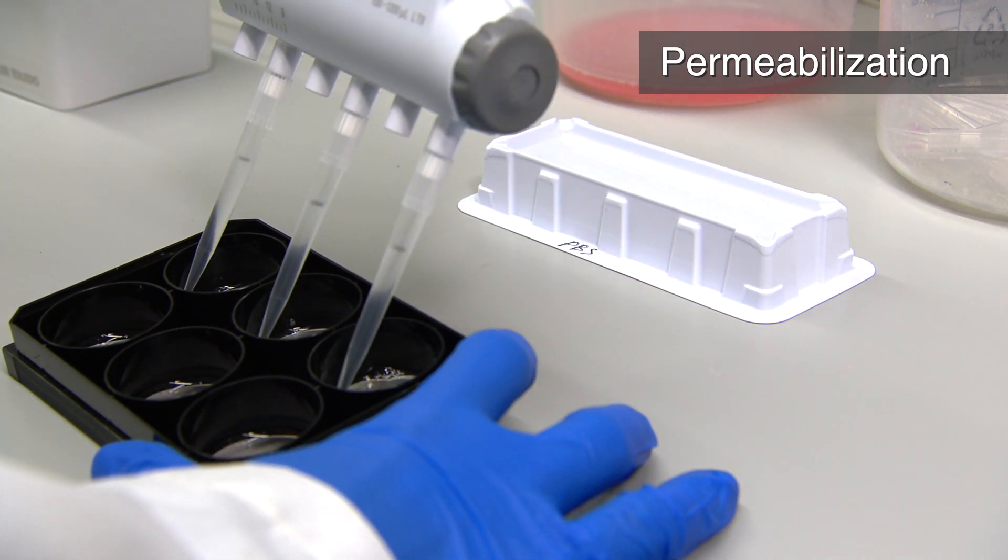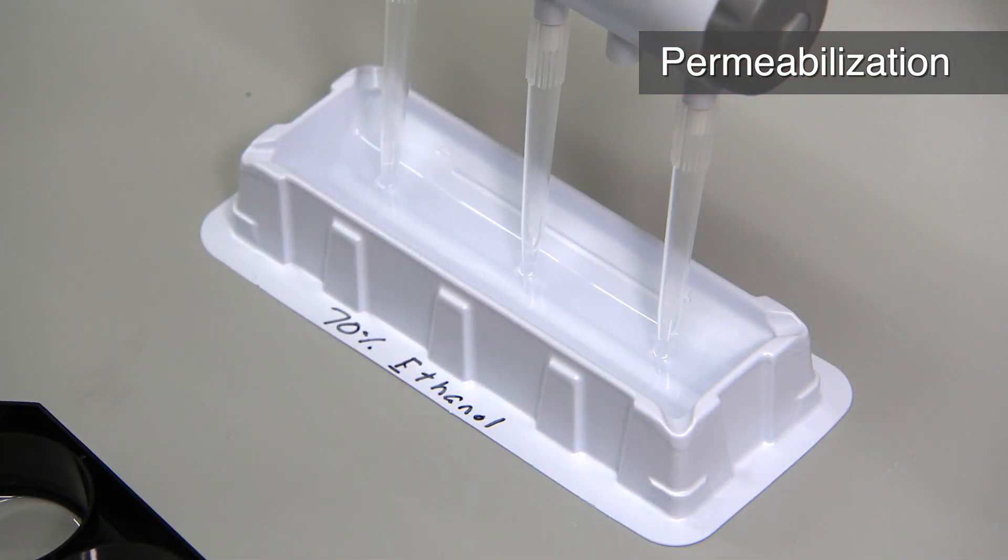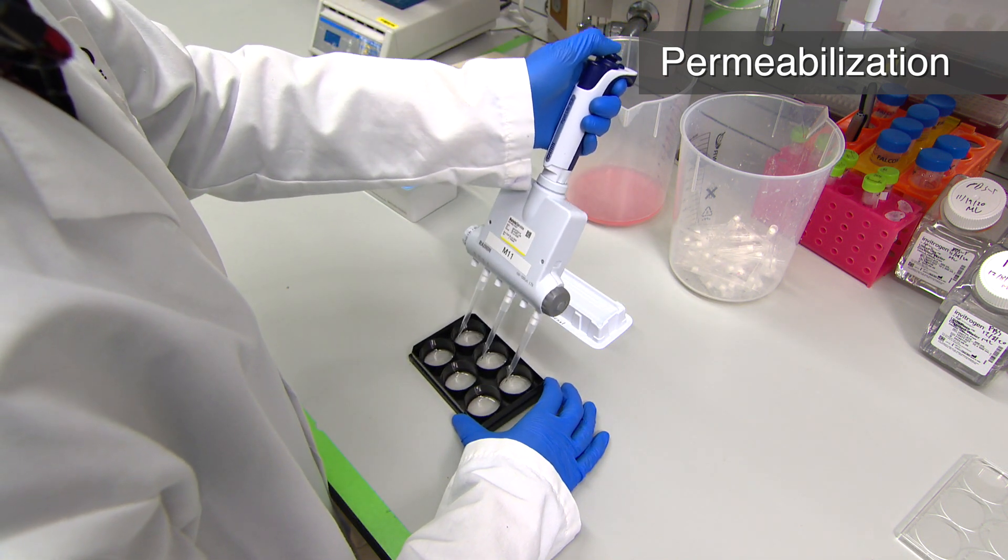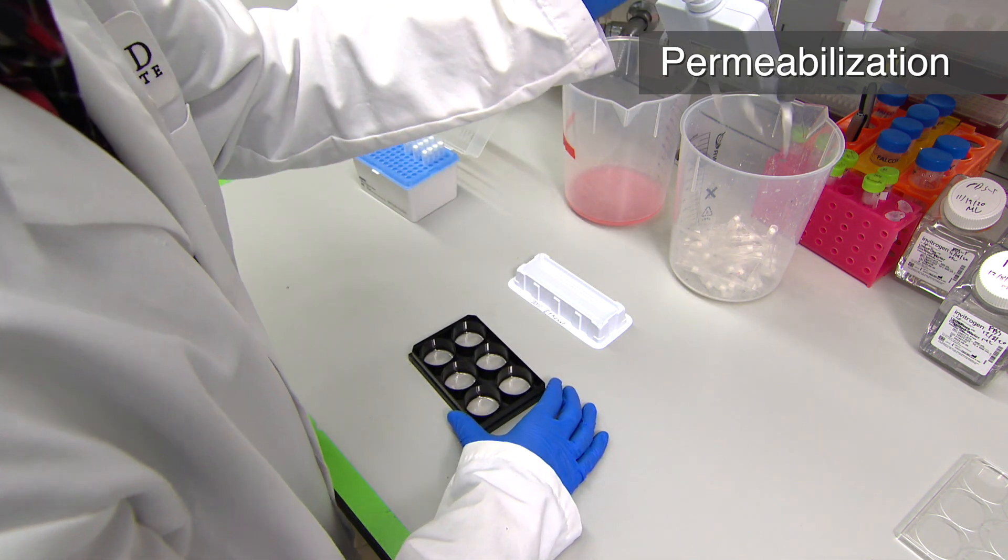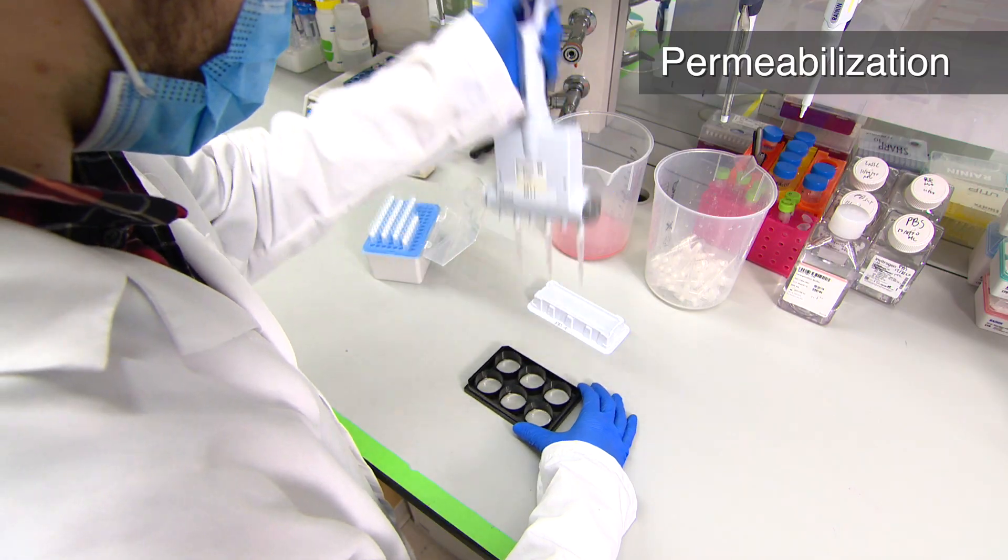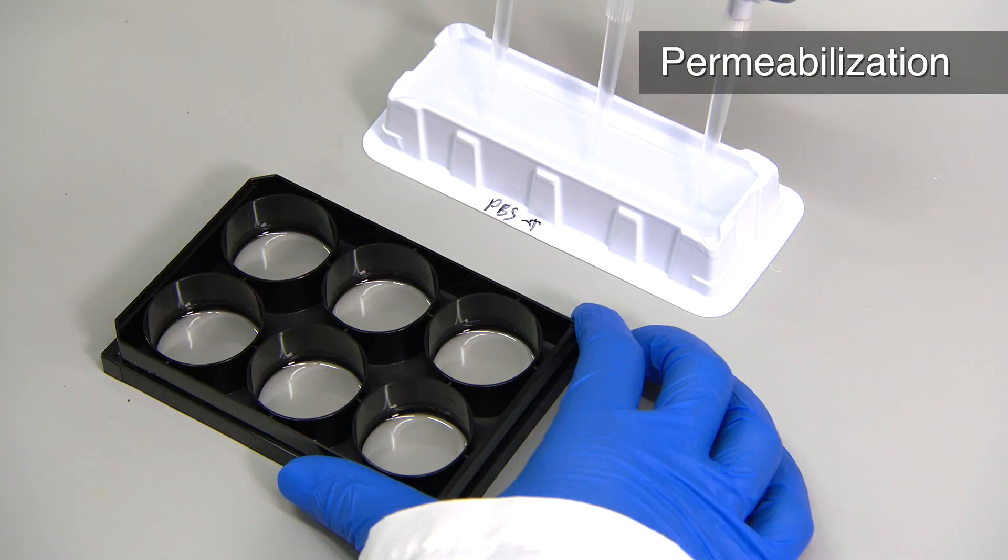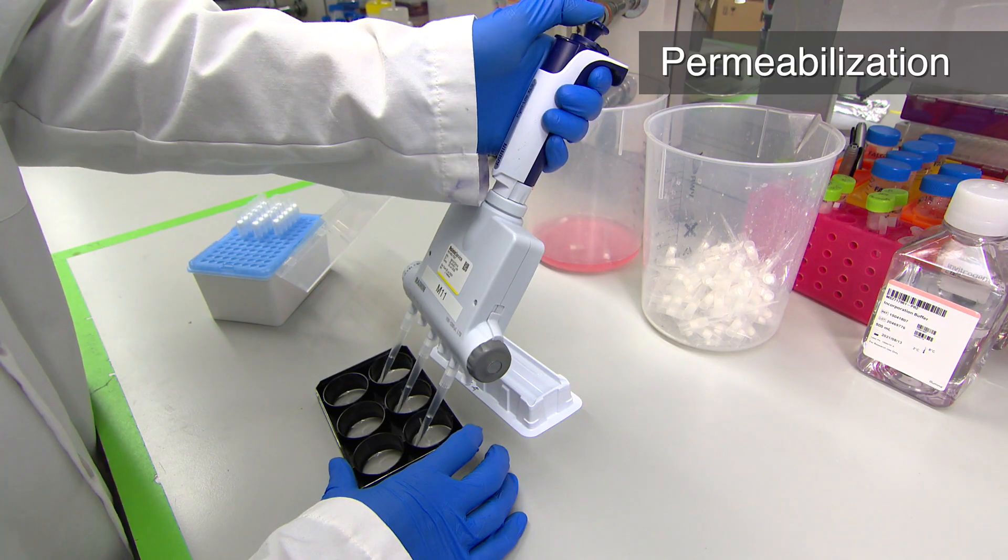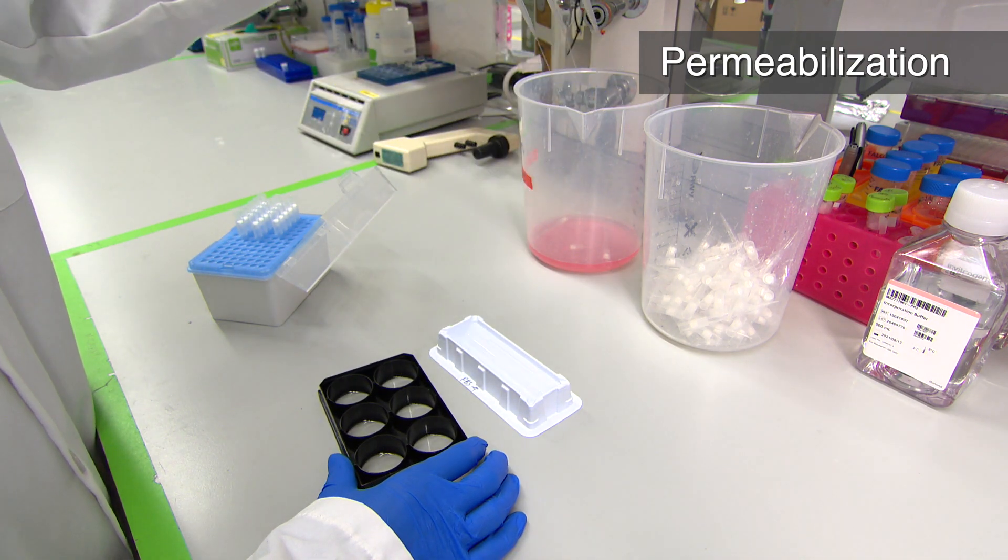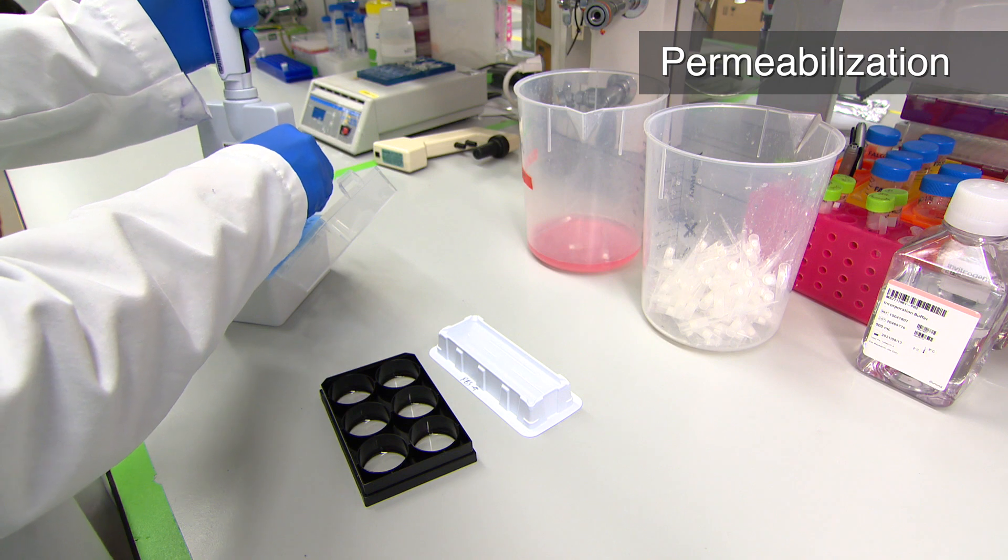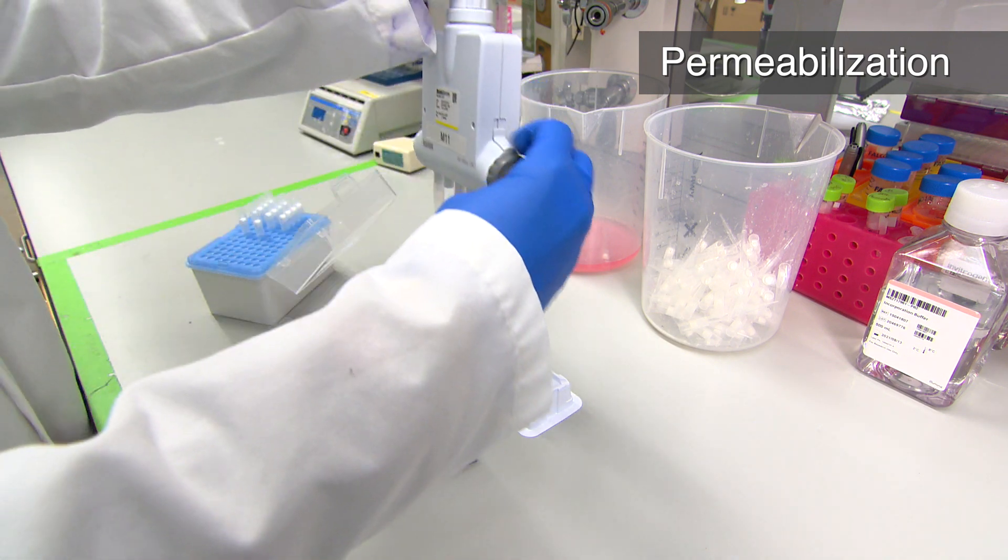Next, wash the plate 3 times with 1 milliliter of PBS and permeabilize with 1 milliliter of 70% ethanol for 30 minutes at room temperature. Next, remove 500 microliters of ethanol. Serially add and remove 1 milliliter of PBS-T 6 times. Avoid exposing the plate surface to air until ethanol is diluted out. Finally, remove all liquid and perform 3 additional PBS-T washes.